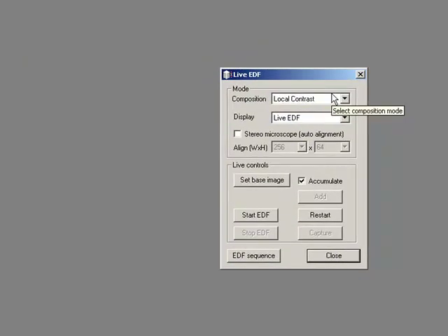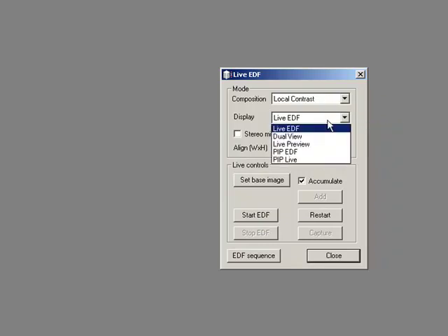Under Live EDF, I can select my method by which I want to stick the images together. I have local contrast, which is pretty good for bright field work, and I can just say I want to do Live EDF.